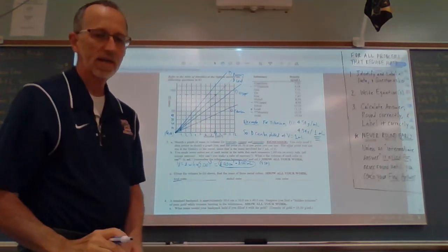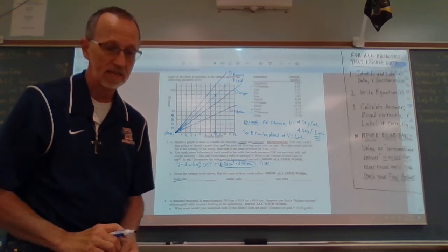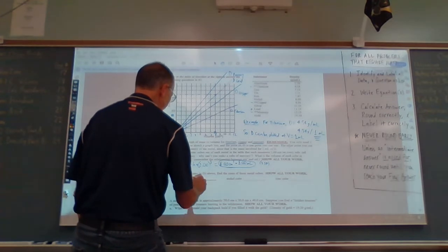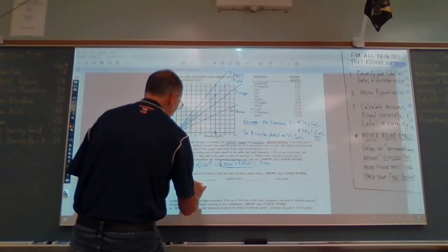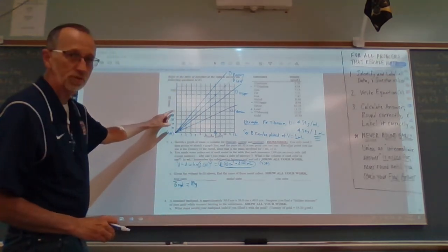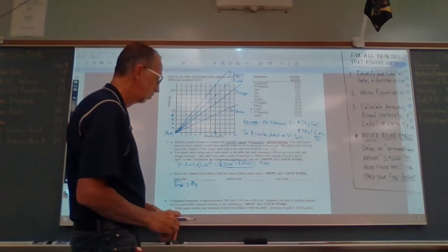And it looks like it's very close to 90, maybe slightly less. So let's say from the graph, it appears to be around 89 or 90 grams. All right, we'll say 89. It was just barely not quite at the 90. And again, I used the whole number here because all these are to the whole number. So that's what we did there.